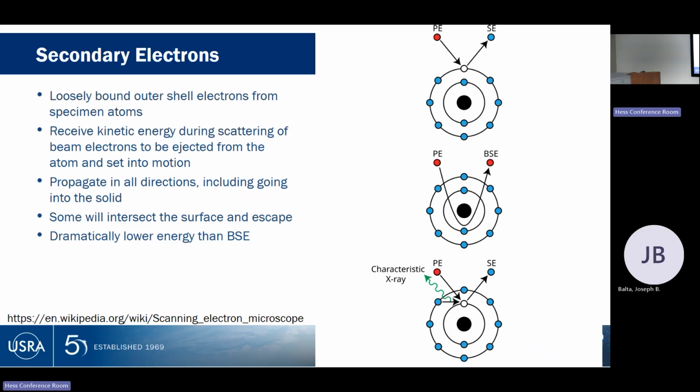So we are producing a secondary electron because it's literally the primary one's the one I shot, the secondary one's the one that came out. So if we do the pool metaphor, this is the cue ball coming in. The secondary electrons are the electrons that scatter out as it hits the other balls.